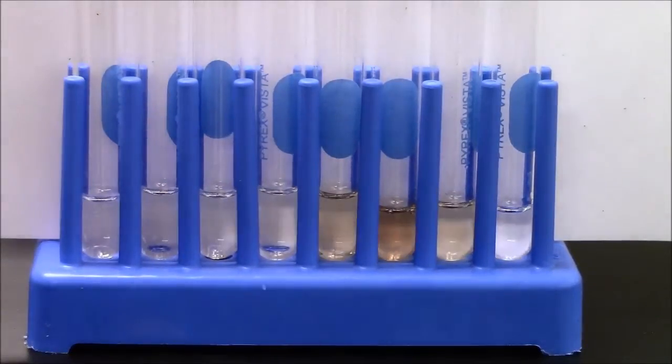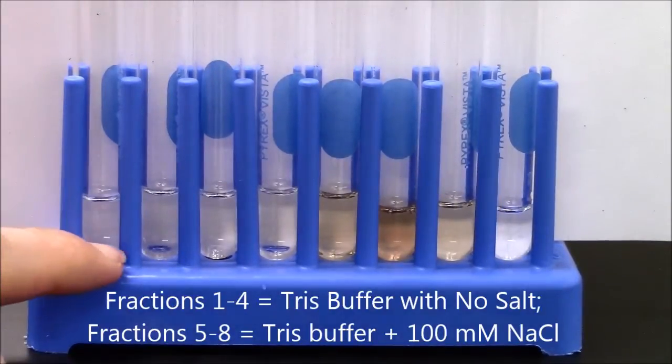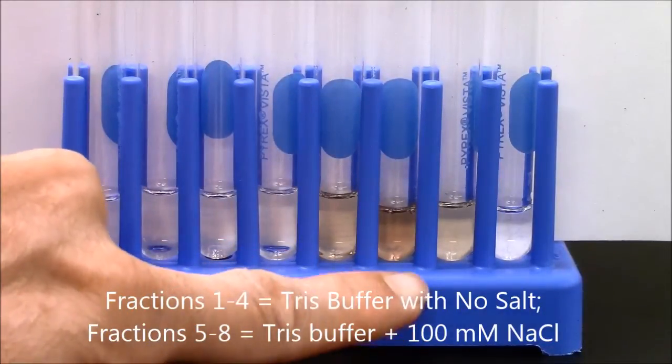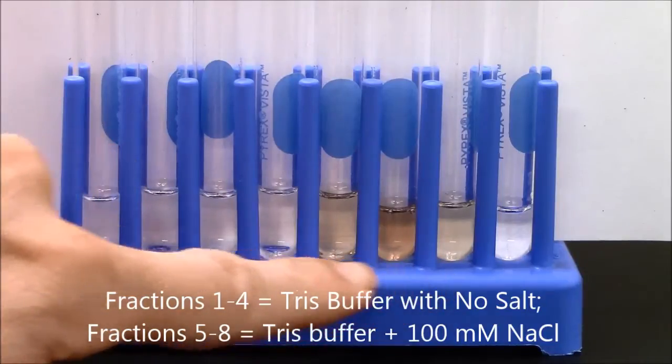Here's a visual representation of my elution profile. You can see these do not have any hemoglobin. But then these colorful fractions here have hemoglobin. This is my peak hemoglobin fraction right here.